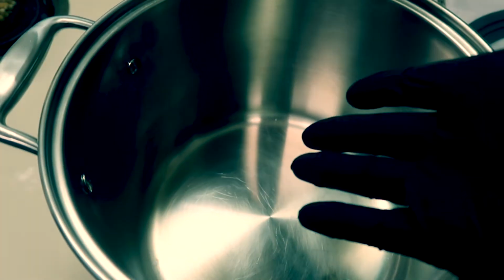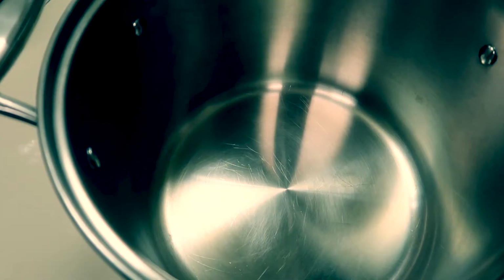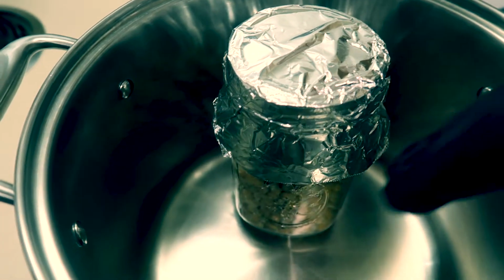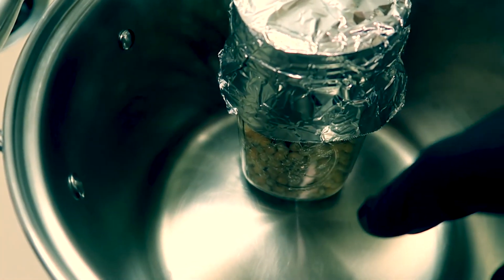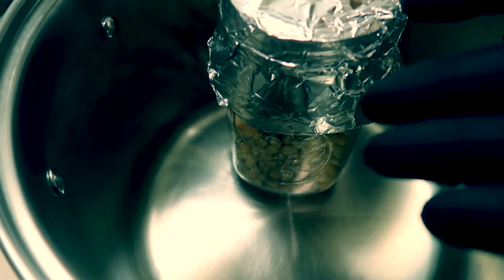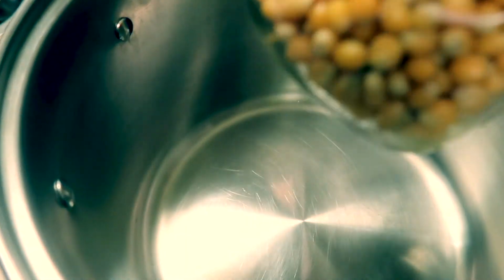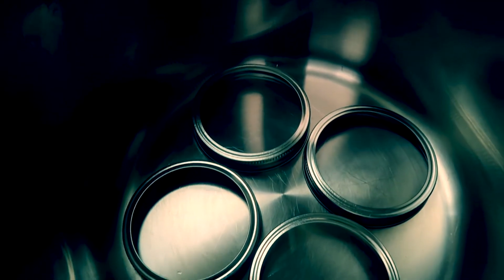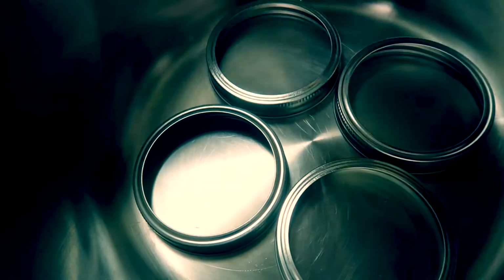What we want to do is basically steam sterilize the jars. So you want a pot that's big enough to hold your quart jars, but you also want to be able to raise them up from the bottom of the pot so that the water can boil underneath them and steam them. You don't want to cook the jars directly on the bottom of the pot because then you could end up cooking the grains through the glass. So if you've got some extra mason jar rings laying around, you can definitely use those as a makeshift trivet.